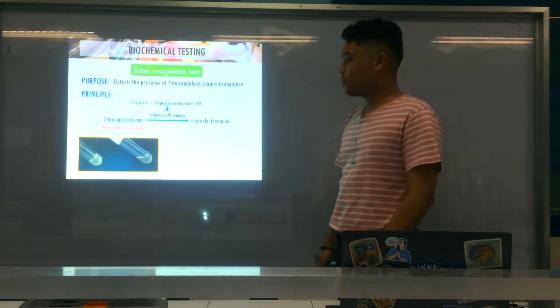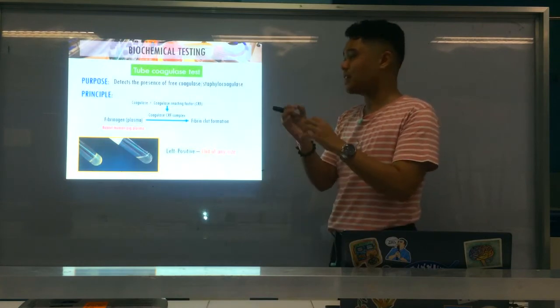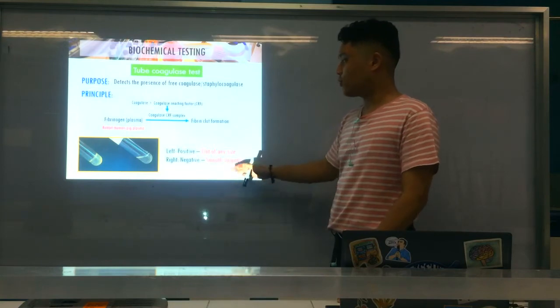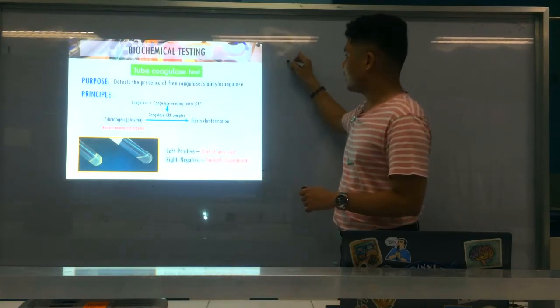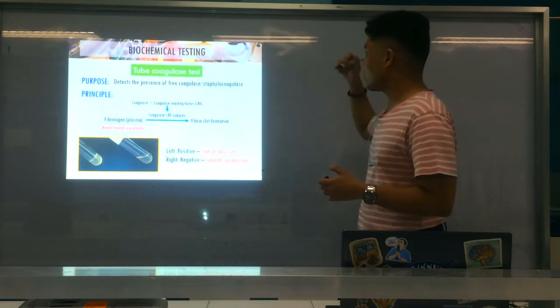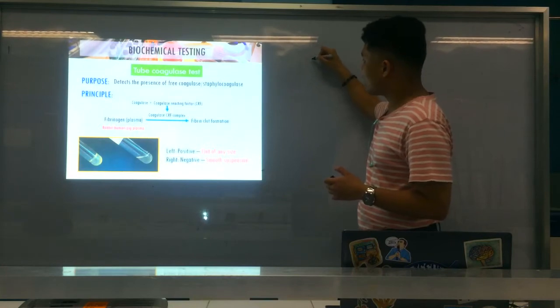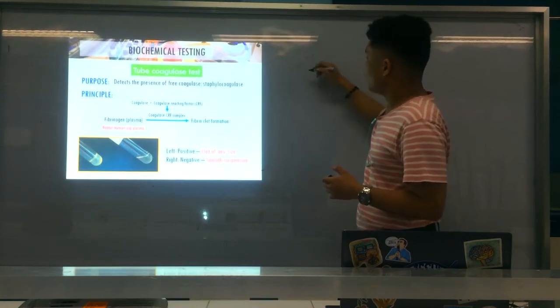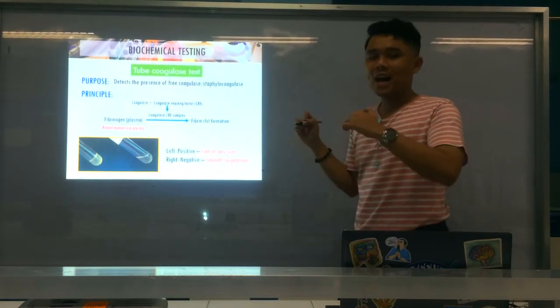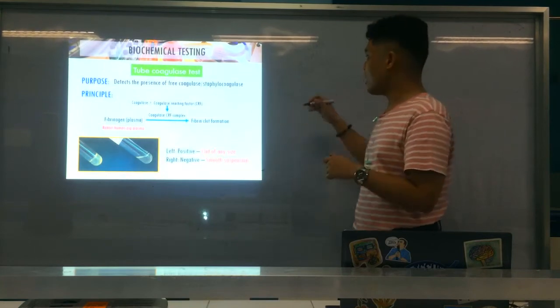Alright, ayan. So again, here's the positive result. Positive is clot of any size, so nigahi siya, alright? Mas maklaro gid siya, mas definitive pod. And ang negative is smooth suspension. Now, a very important thing to remember lang sa tube coagulase, guys, is you incubate the tube at 37 degrees Celsius for 4 hours only. Okay? 4 hours ra gyud. Alright? 4 hours. Now, after 4 hours, if wala nimo na-detect na naay clot, what you do is kuwaon daw ni siya.